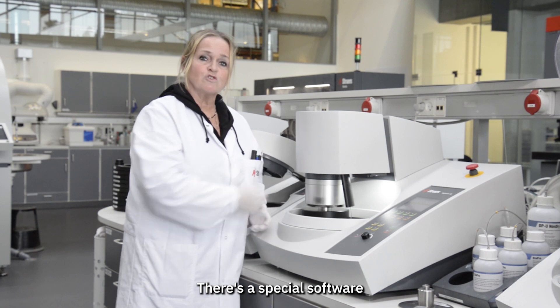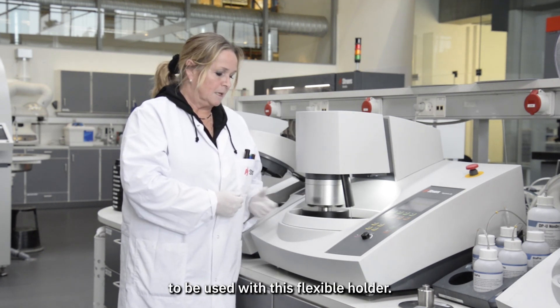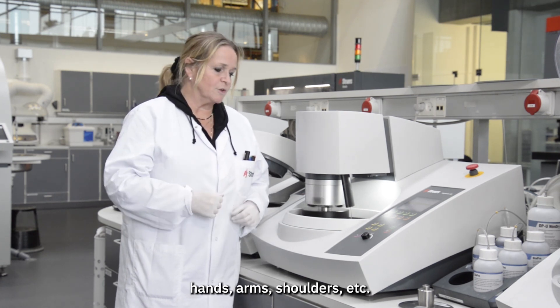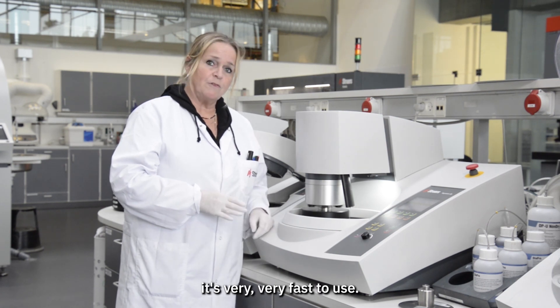There is special software to be used with this flexible holder. But this is to save the operator's hands, arms, shoulders, etc. No need for clamping. It's very, very fast to use.